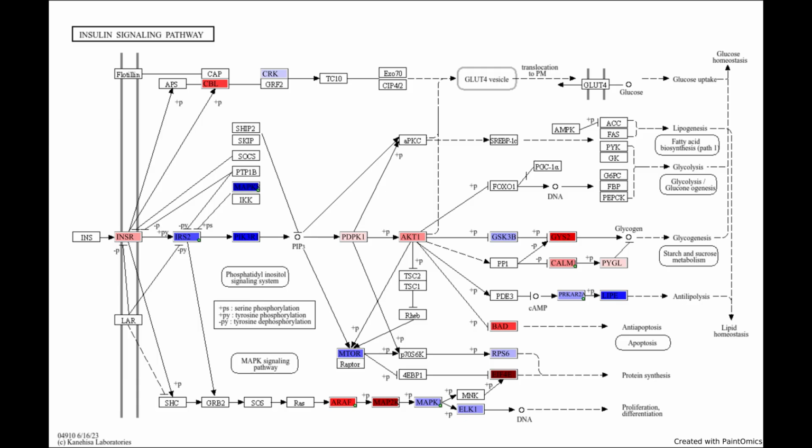Paintomics is a great tool to explore how the members of pathways have changed. This is an example output of Paintomics, the insulin KEGG pathway colored by the fold change of a test condition versus control. Using your domain expertise, this helps to draw your conclusions about what is going on in your model system. Let's see how to get here.